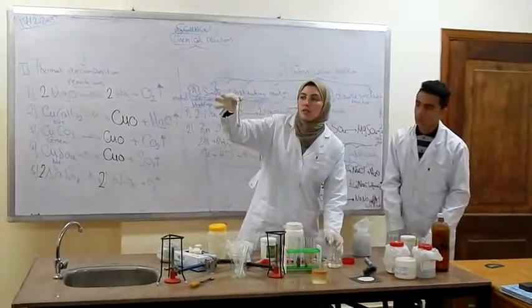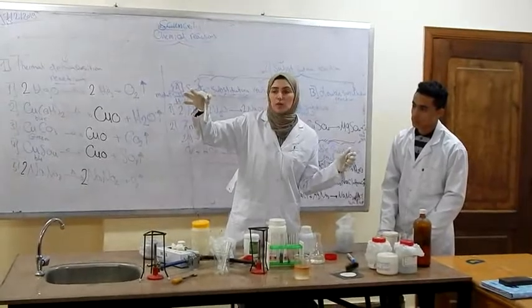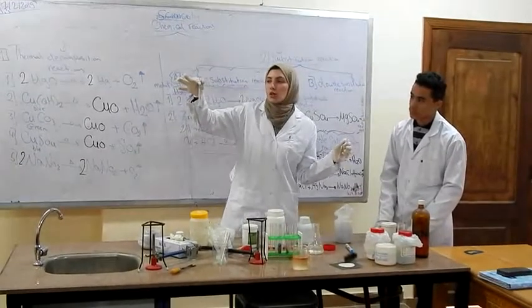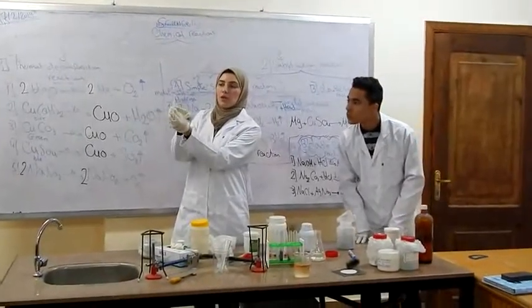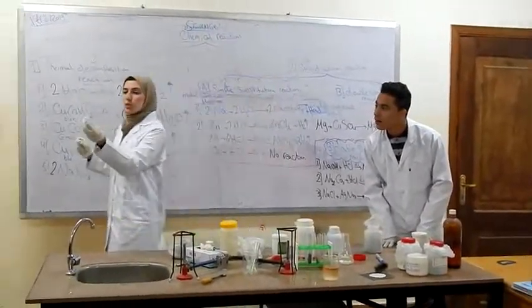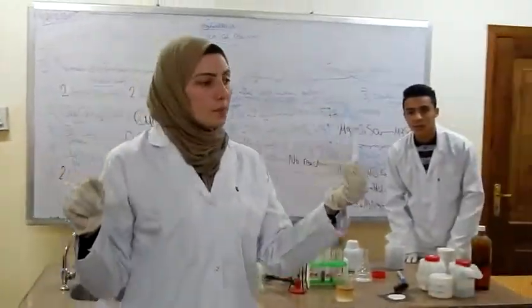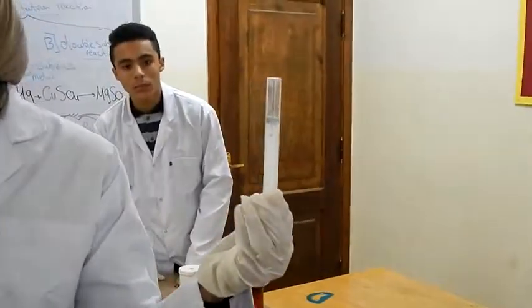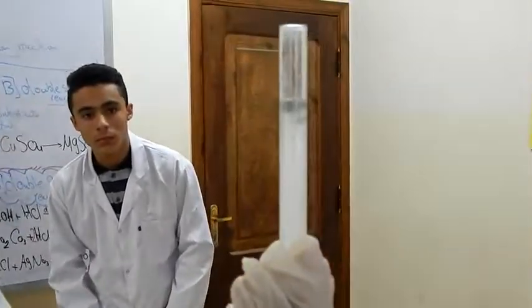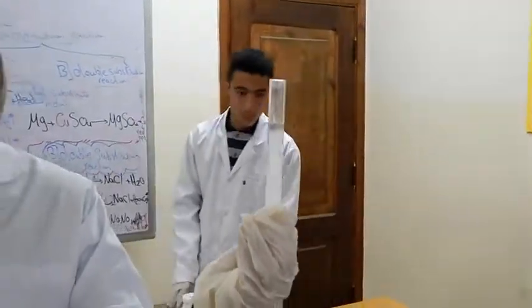the reaction doesn't occur immediately. It will take a short time to react. Why? After a short time, it starts forming bubbles. Why does aluminium take a short time? As it comes before zinc in the chemical activity series? Why? More active? No, due to formation of a layer of aluminium oxide above the aluminium metal.